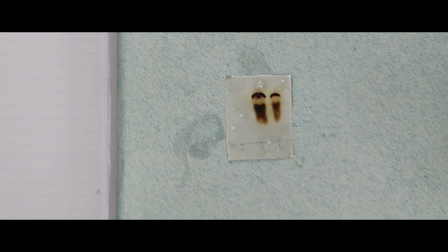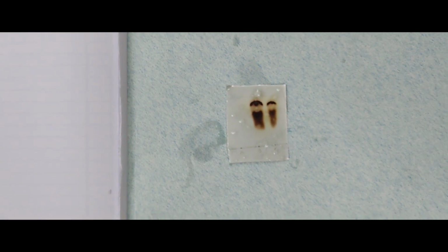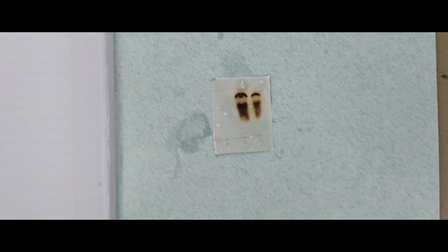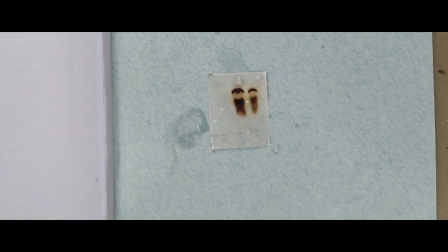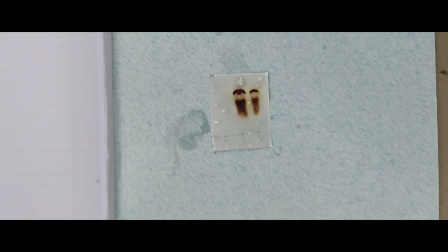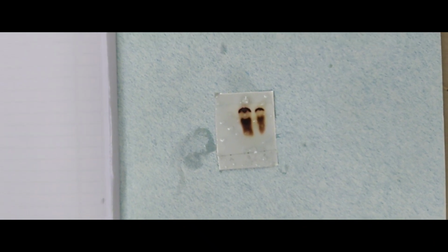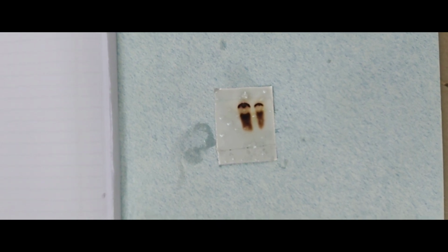After air drying, you observe very good color spots, very nice. The same color was obtained for the API, the diclofenac active pharmaceutical ingredient, and the injectable dosage form. A contains the API, and B and C contain the injectable dosage form.